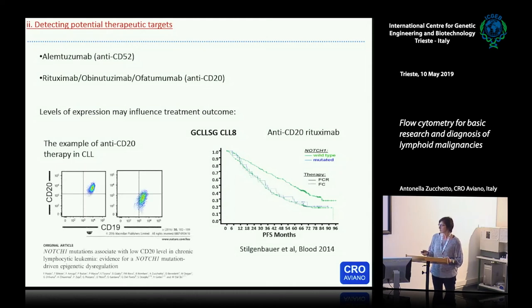And in our study, I won't go into detail, it's just to show this example, we show that this particular group of patients expresses lower levels of CD20, and we also described the mechanism of this decreased expression of CD20.